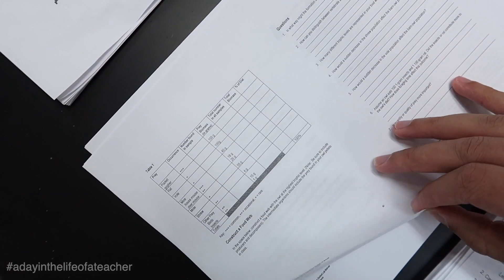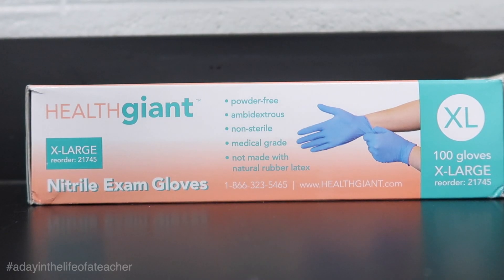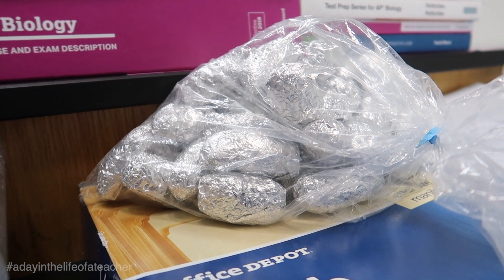Owls, when they eat, cannot digest the bones. Their body regurgitates them like a hairball. Students are going to be given the hairball that the owl spits out, and they'll have to break it apart and try to put the anatomy together so they can identify whether they found a rodent, a shrew, a mole, or a small bird. Since we are dealing with foreign objects, we need to make sure we have worn gloves today. We're also going to need a bag of owl pellets.